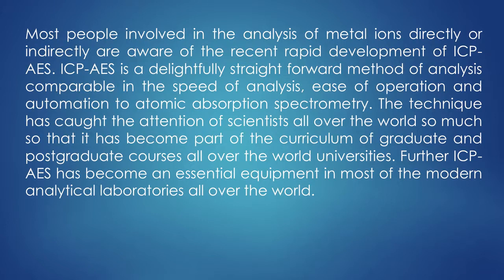Most people involved in the analysis of metal ions, directly or indirectly, are aware of the recent rapid development of ICP-AES. We are all amazed at how fast the technique has caught on, a very beautiful, delightfully straightforward technique, with ease of operation and automation comparable to atomic absorption spectrometry, but it is much more than that. It allows multi-element determination simultaneously, even though it is a destructive technique.